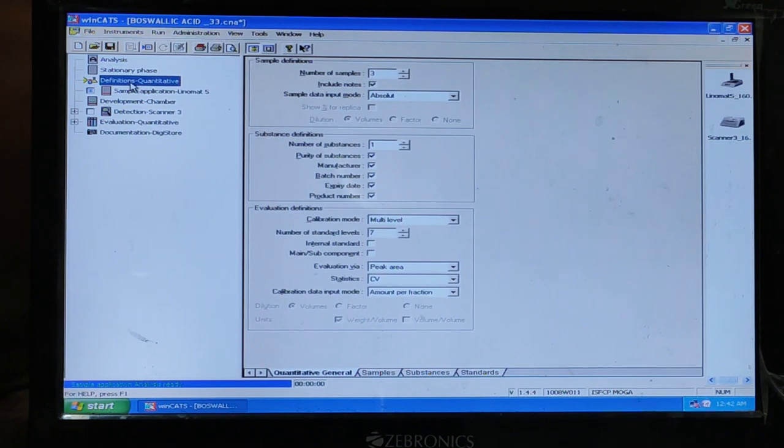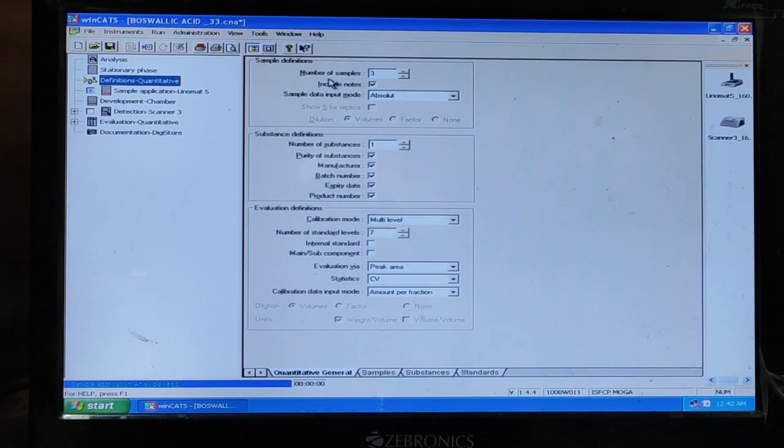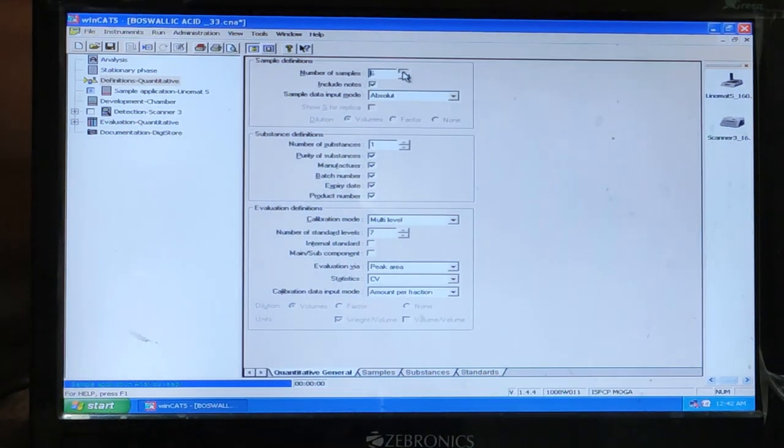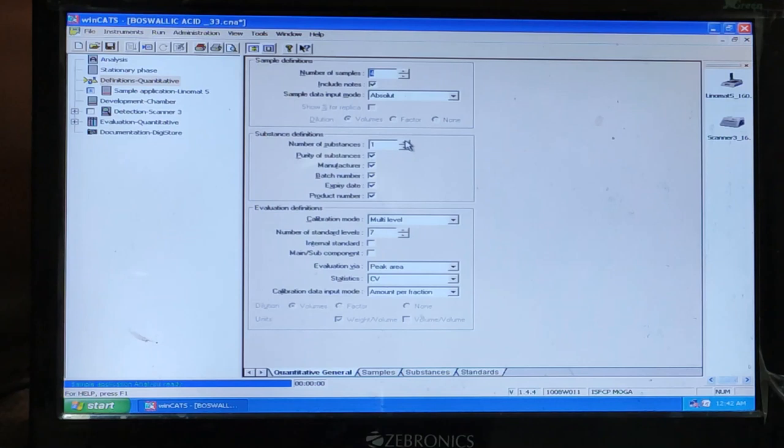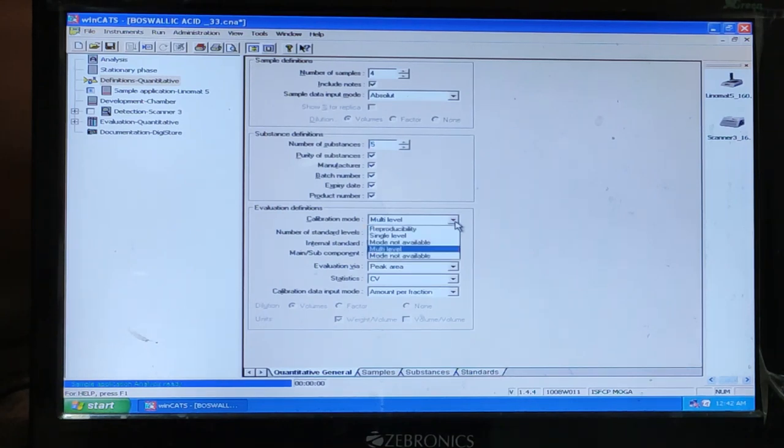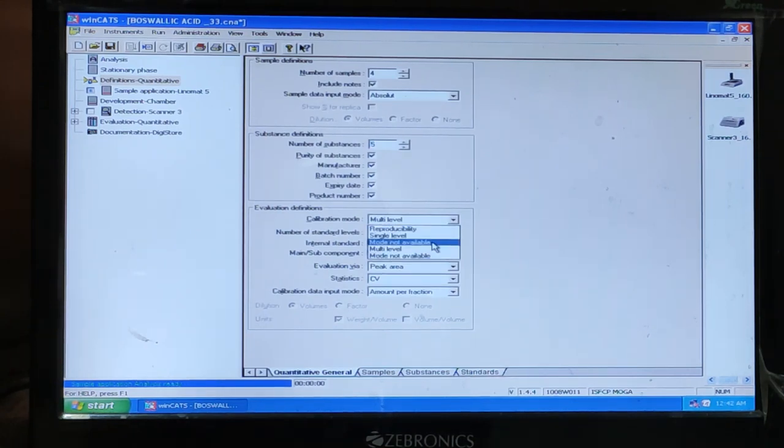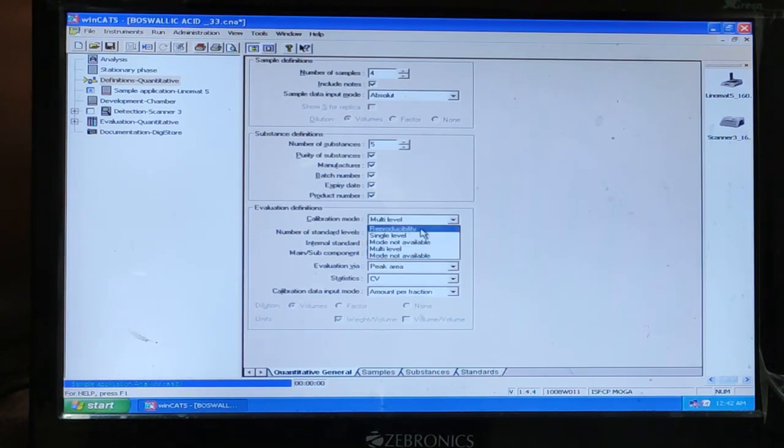This is the definition, quantitative. Here you can choose how many samples do you have. Number of samples you can increase or decrease. Then number of substances. How much number of substances do you have. Then calibration mode you can do. Single mode. Multi-level. Here you can choose.